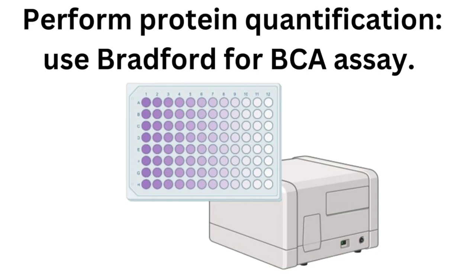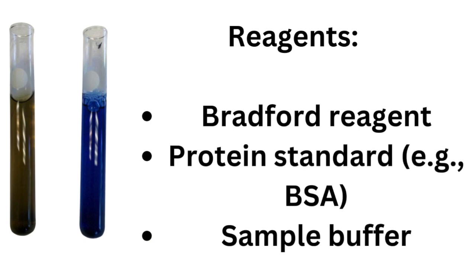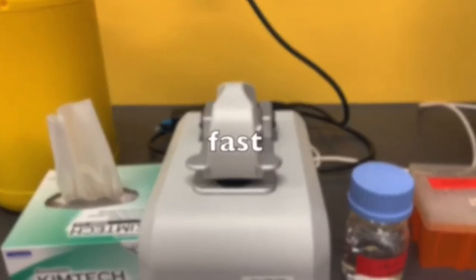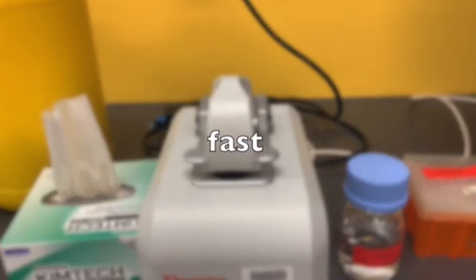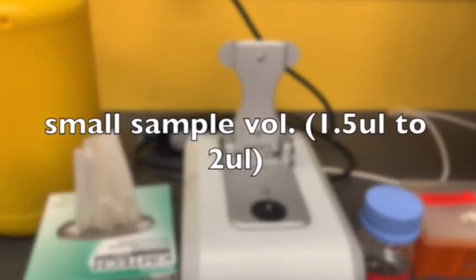Bradford or BCA assays are quite commonly used. When using a BCA or Bradford assay, you need to prepare standards and your samples, then measure the absorbance using a spectrophotometer. The nanodrop is easier — you don't need standards — but again, many of the buffers used in western blotting are not compatible.